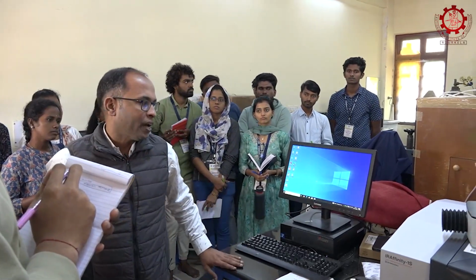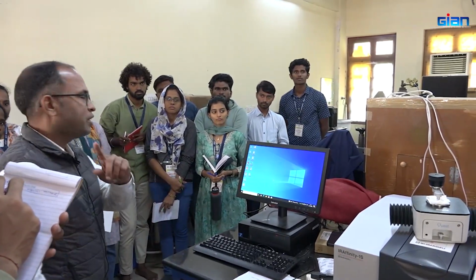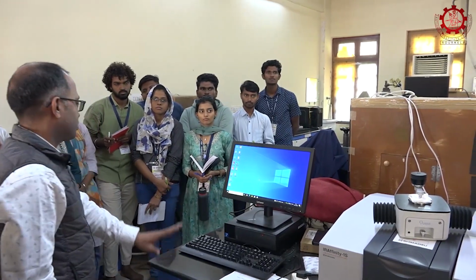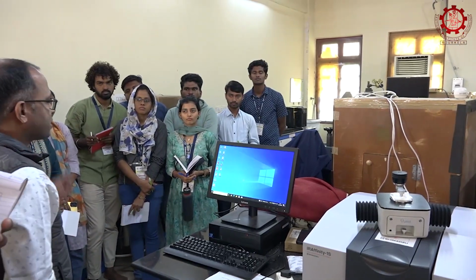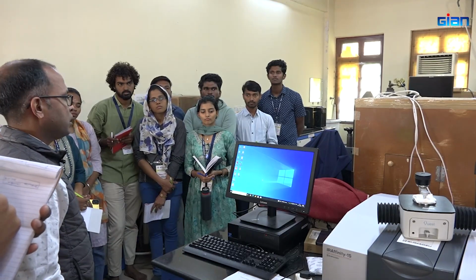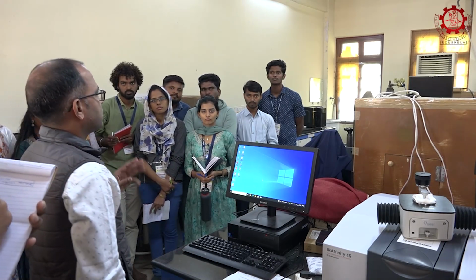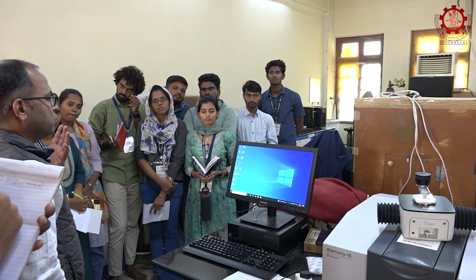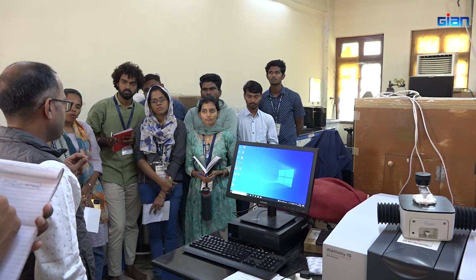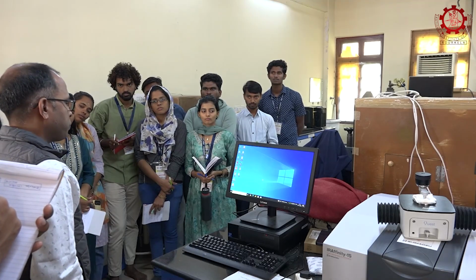So coming to this FTIR, my plan is to have one demonstration. Of course, we have Subhadip Giri. He is a trained technician for this spectrometer as well as NMR. So he will help us also in the operation of this one, and we'll do samples. Of course, you have got 1 sample from your side, so 3 samples we will do. Basically, I try to do 2 types of samples: one is in solution and the other one is solid. So you will see how we do those samples.